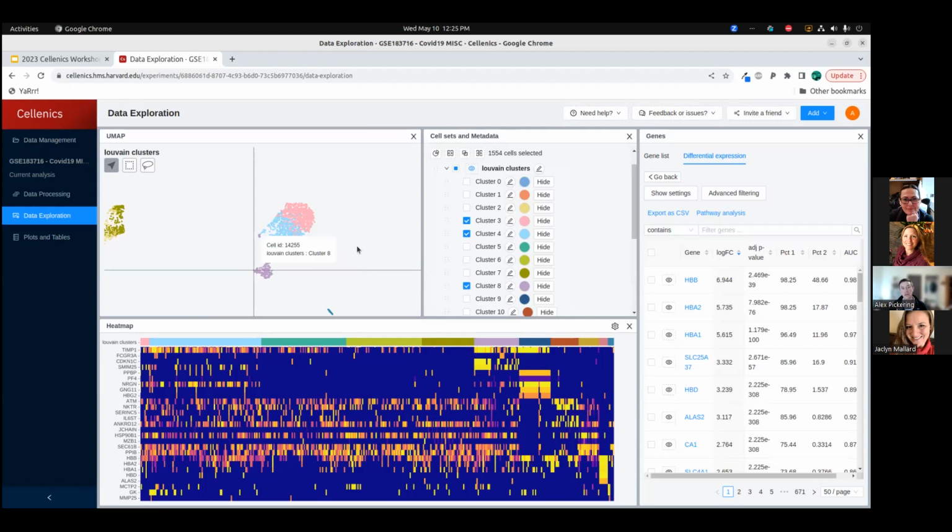And that can be a useful thing if you want to really explore, if you think there might be subclusters within a group of cells. By subsetting the data set, your PCA reduction and your embedding are all going to be based on genes that have that high variability just within this group of cells. So sometimes you can pick out additional subsets within that group. So great question.